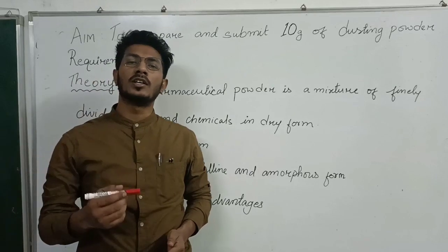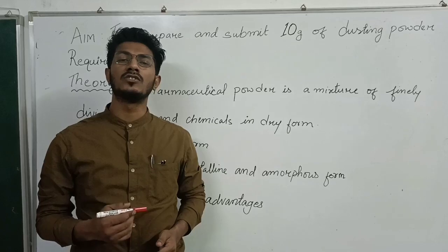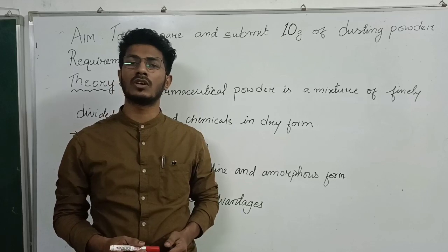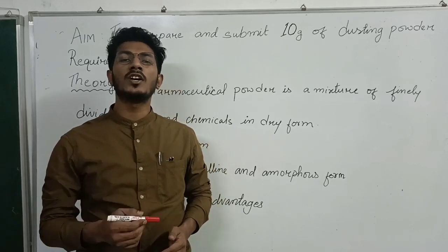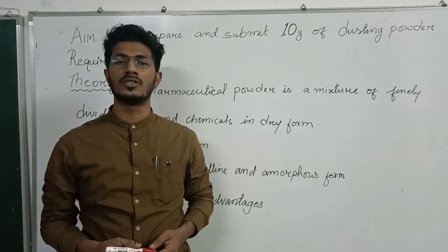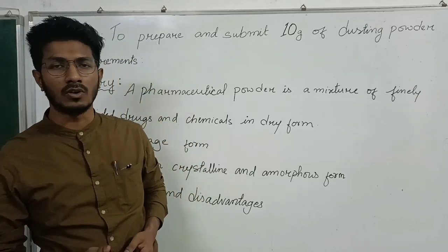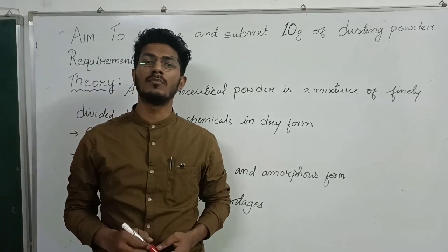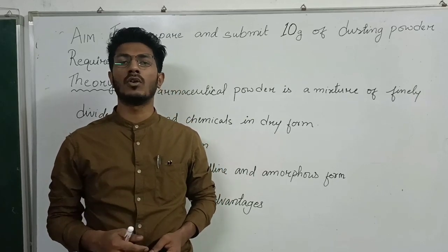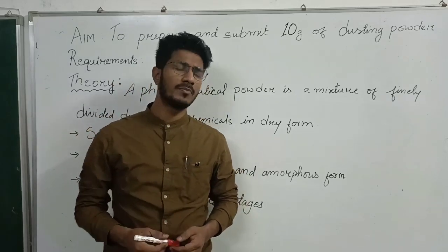And moreover, the particle size of the powders is finely divided, right? Because of the particle size, their dissolution is faster and the onset of action is faster compared to other solid dosage forms like tablets or capsules. Moreover, if the patient is an infant or an old age person, अगर कोई बूढ़ा व्यक्ति है या फिर बच्चा है जिसको टैबलेट और कैप्सूल खाने में तकलीफ हो रहा हो, in such cases powder dosage form can be an alternative where we can disperse the drug in a suitable liquid vehicle or water, and the patient can consume it easily. Not just advantages, there are some disadvantages as well.